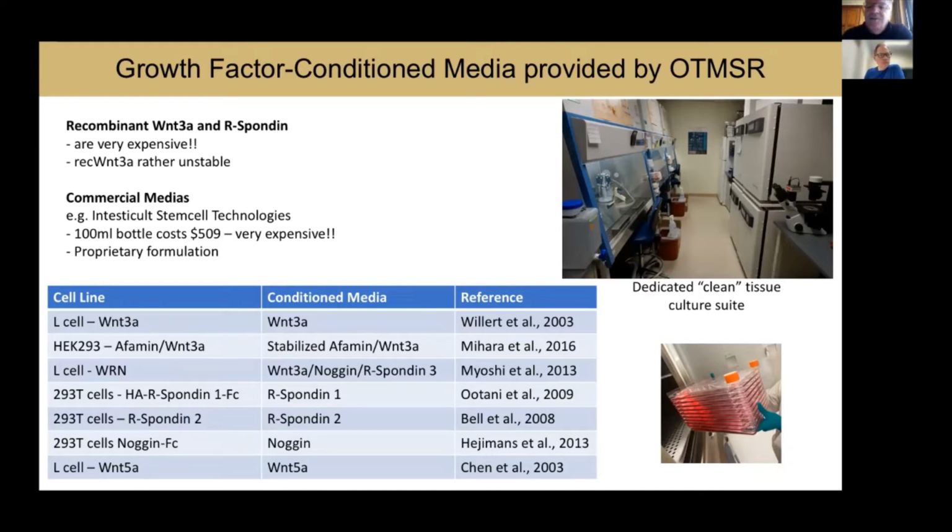So this is just showing on the right our clean tissue culture suite, which is where we generate the conditioned media, and this is where we do our iPS work. And here you can see our bioreactor system that we generate this conditioned media. And I should say that I'm excited with our interactions with Steve, because this is something that we want to expand with CTSR on a number of levels.